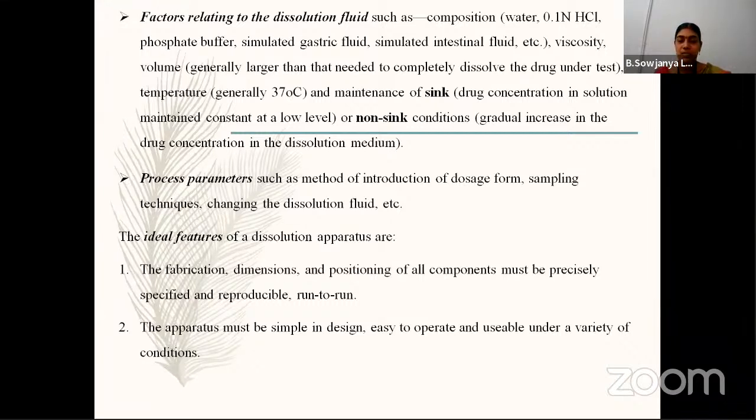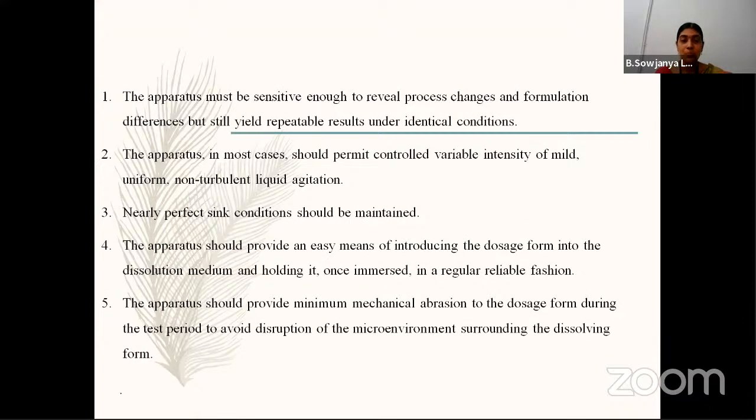The apparatus must be simple in design and easy to operate, and it must permit different controlled variables like mild to moderate, non-turbulent liquid agitation. It should also provide minimum mechanical abrasion to the dosage form during the test period without disturbance of the microenvironmental conditions, to dissolve the drug in a suitable medium and also maintain perfect sink conditions.